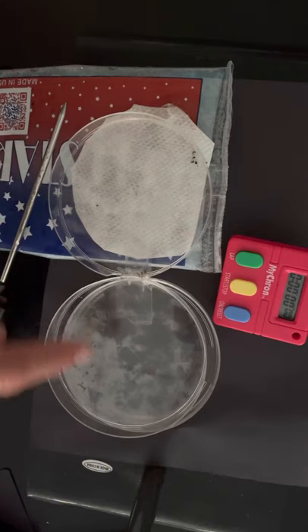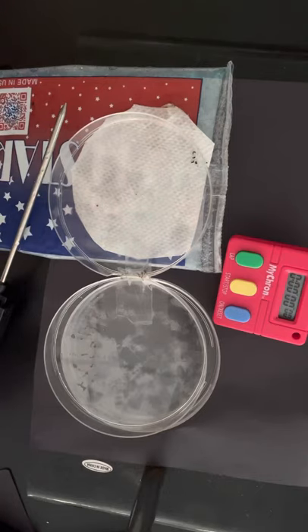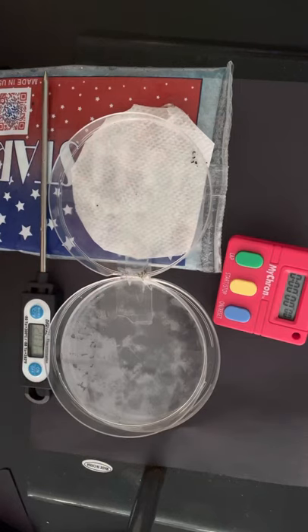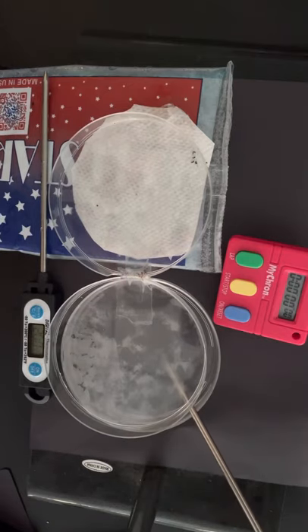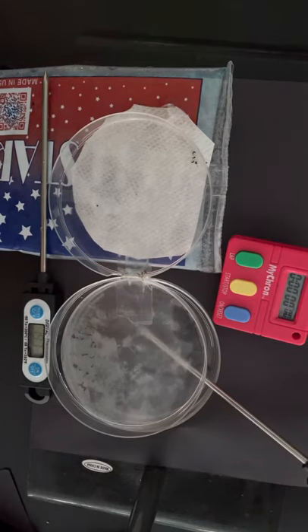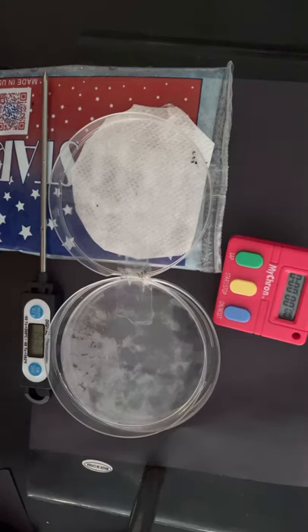There are two petri dishes with an opening between them. We're comparing two environments: a cool side with an ice pack underneath reading about 20 degrees Celsius, and a warm side with a warm bath reading about 32 degrees Celsius.